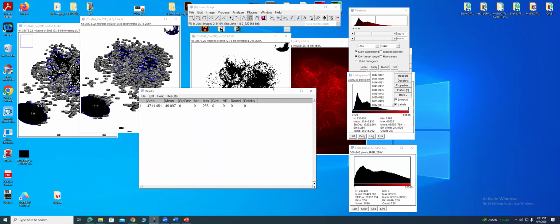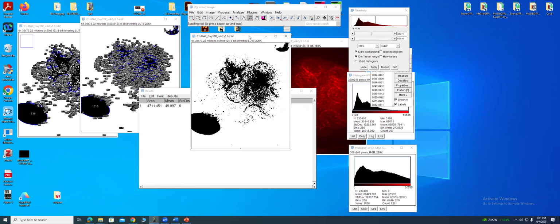I'm no longer interested in that. So segmentation is what you're doing. Once you've segmented an image, you have your information as objects that you can do all your calculations on. You can measure colocalizations, you can do overlays, you can do different things with it, right?